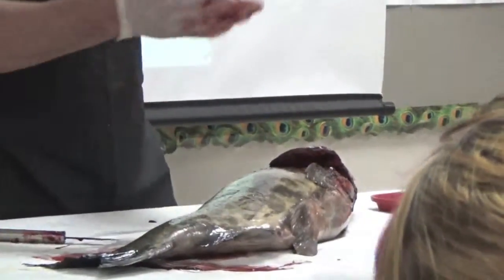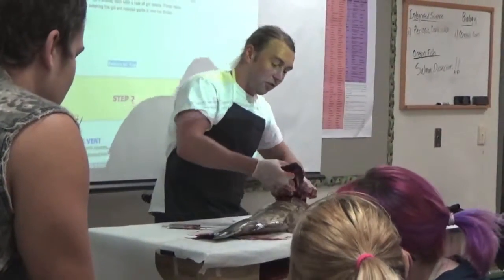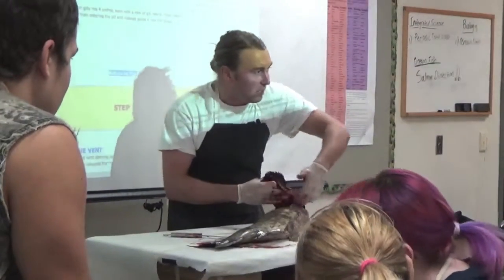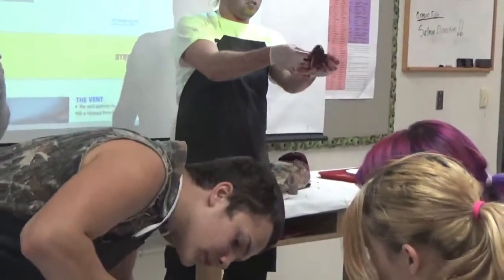Did everybody see how I did that? Here's the gills. You pull that operculum back and you cut at the front. You start at the front here, and then cut down around the inside of the gill where it's connected to the rest, so that you then have your gills.